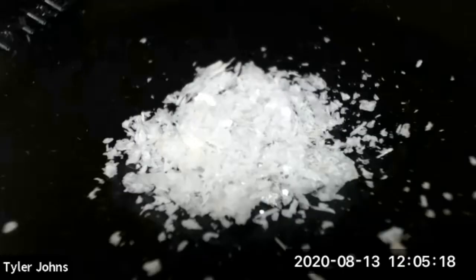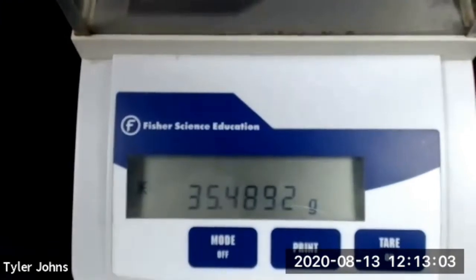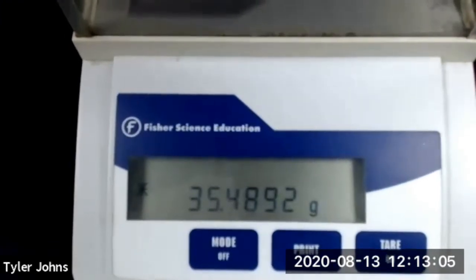I've collected our purified and dried sulfanilamide crystals on our pre-weighed watch glass. We'll now determine the mass of our pre-weighed watch glass and our crystals so we can determine our percent recovery. The mass of our pre-weighed watch glass and our purified sulfanilamide crystals is 35.4892 grams.